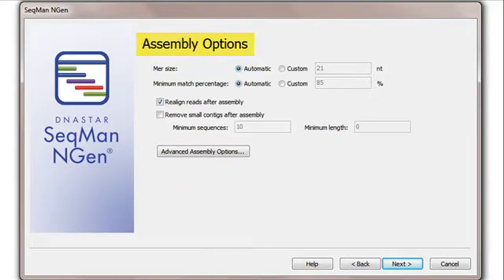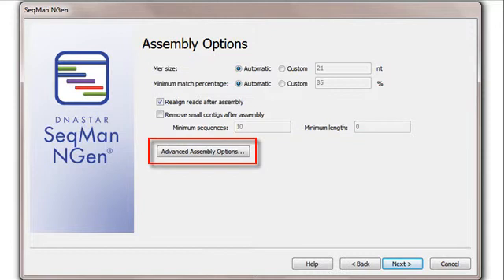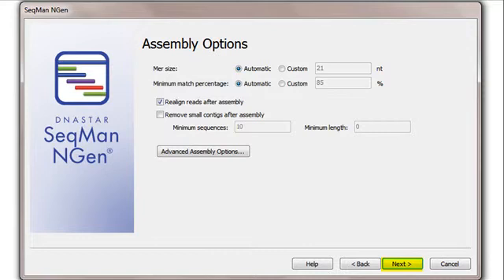In the Assembly Options screen, both standard and advanced parameters can be adjusted. Again, these have already been optimized for my data and assembly type.